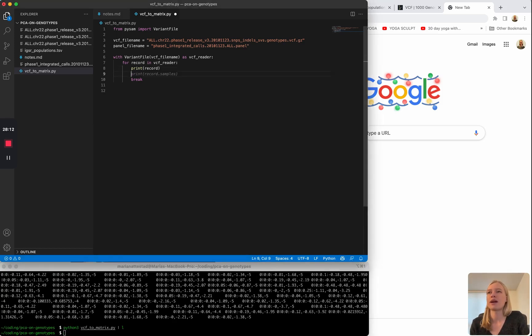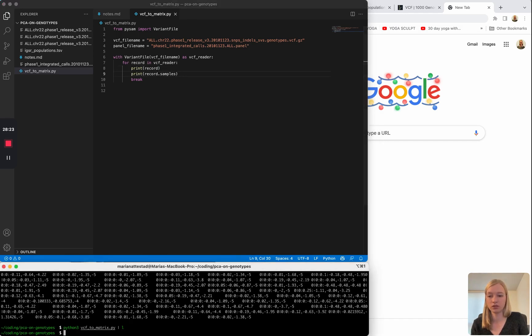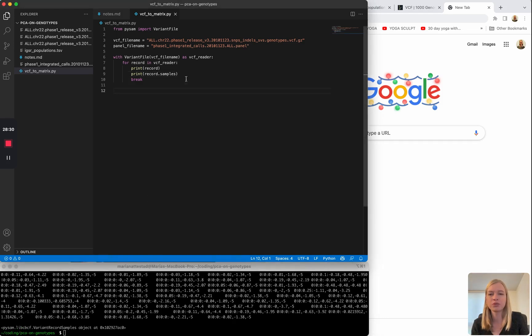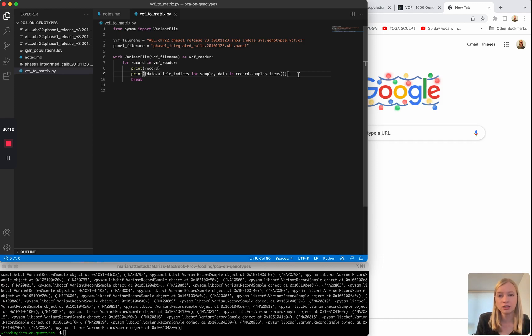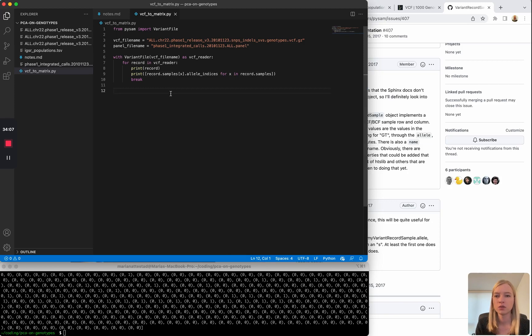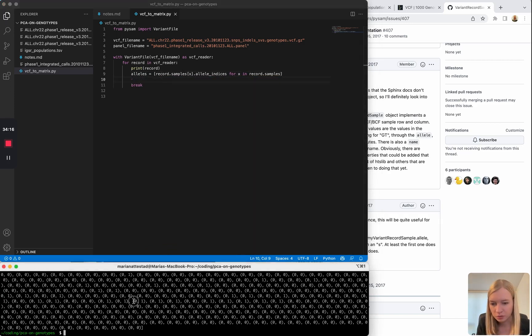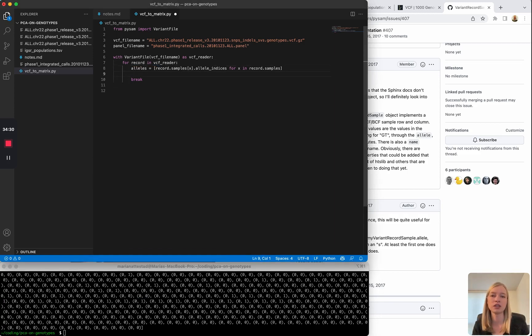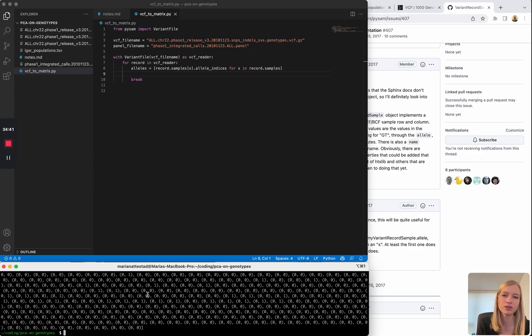After a bit of Googling on how to access the alleles, we get a VariantRecord samples object with the alleles we want. They're all numbers — some zeros and some ones, and there can even be twos and higher numbers if the variant is multiallelic. Zero always refers to the reference, one refers to the first alternate allele, two to the second alternate allele, and so on.